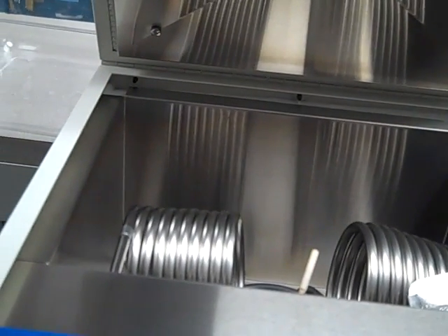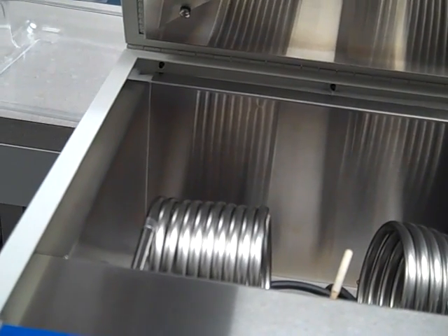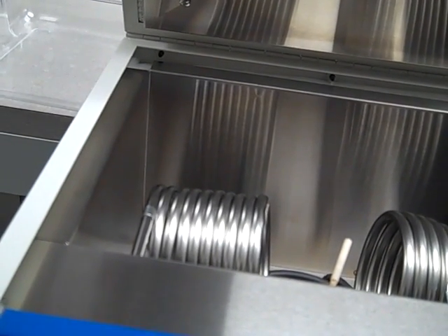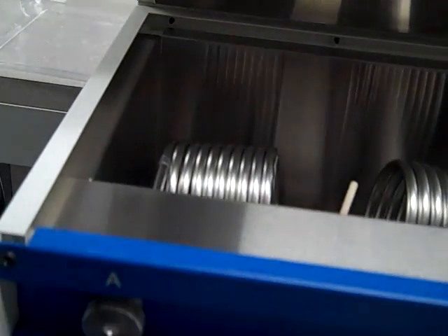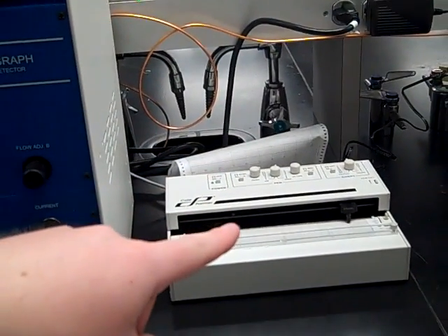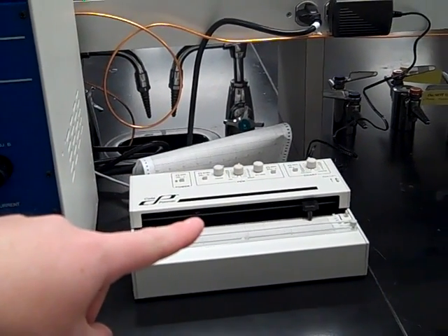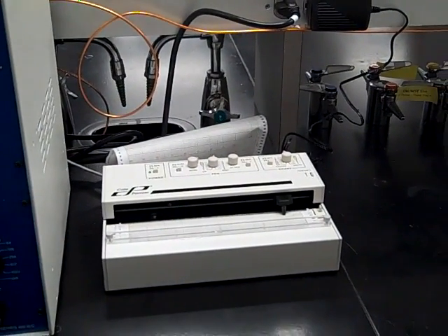So the column on the left is for injection port A. That's what we'll be using. And as your sample travels through that column that's heated to 125 degrees inside this oven, as it comes off the column and hits the detector, we'll be able to record those peaks via the electrical current that it's creating on the chart recorder right there.